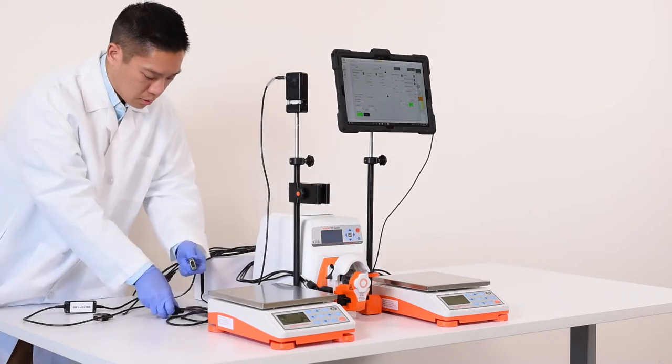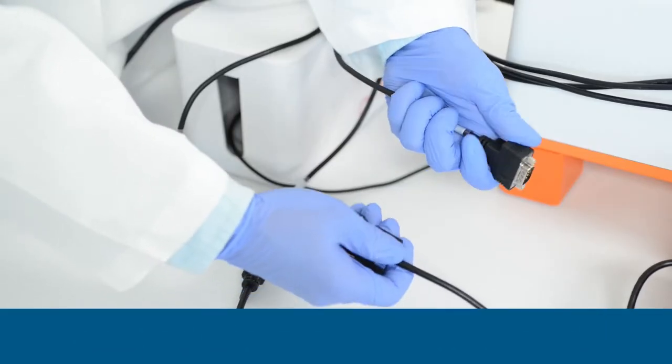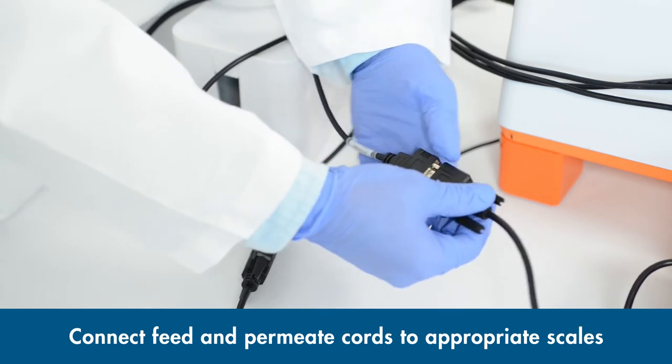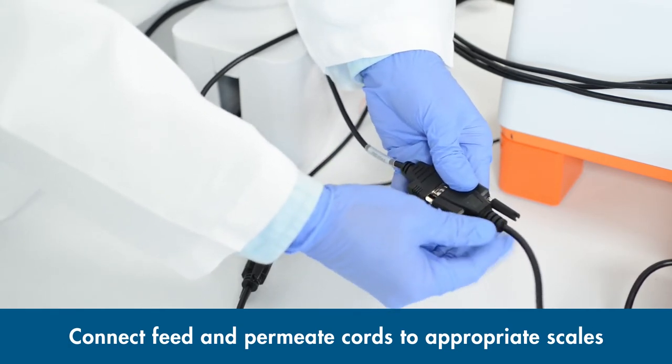Next, plug in the connections from the feed and permeate scales to the respective ports on the KFCOM octopus cable. Ensure that the connections are tight and properly secured.